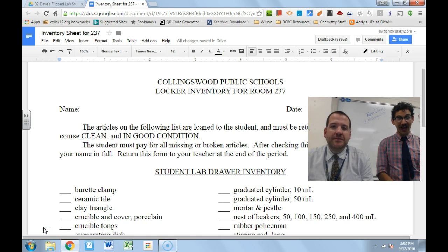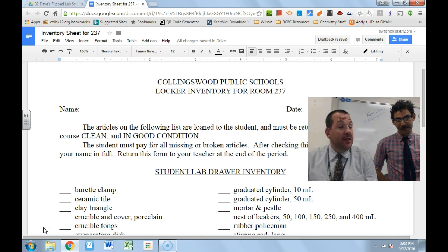Hey everybody, I'm Mr. Walsh. I'm Mr. Weingrad. And we're going to introduce you to some of the glassware that you're going to be using this year in the chemistry lab.